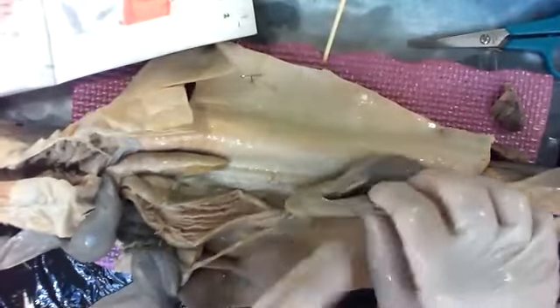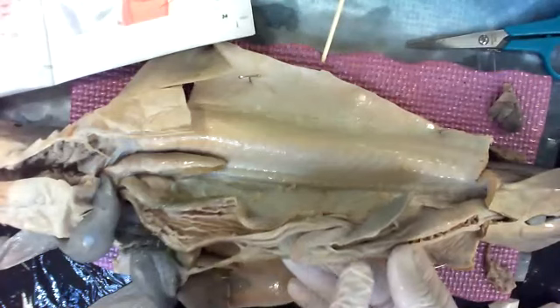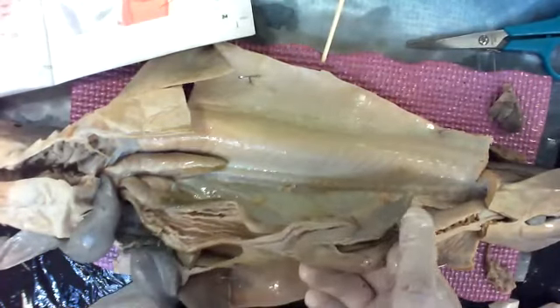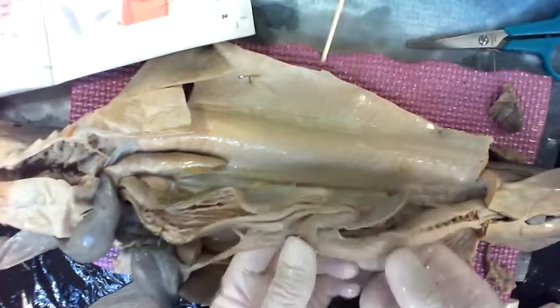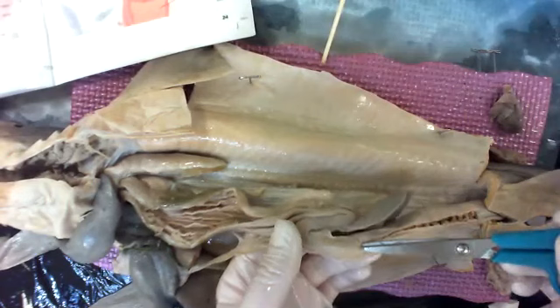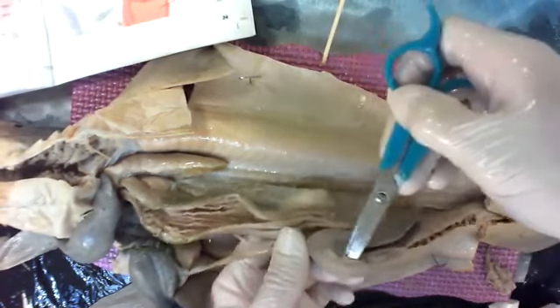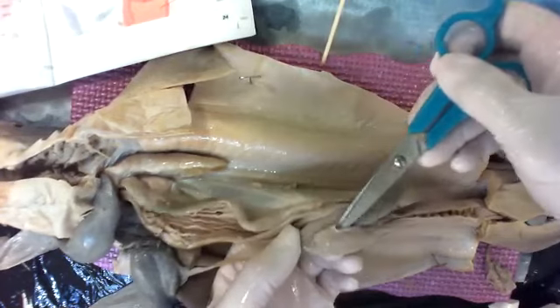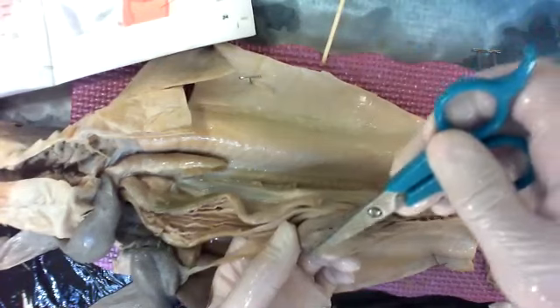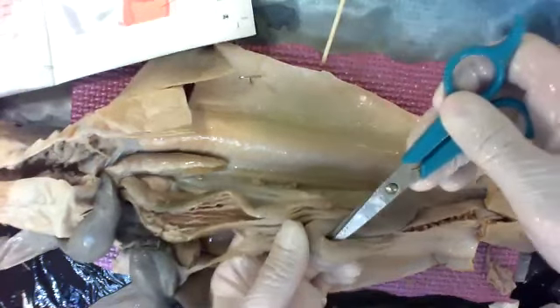Okay. Another organ is this one. It's really important. See it right there? Kind of hides. Here's the J shape of the stomach. There's the spleen. This little guy is hiding. See if we can get underneath it. Probably not easily. It's right there. It looks a lot like the other tissue around it, but if I break the sac, you can see it's a totally different organ.